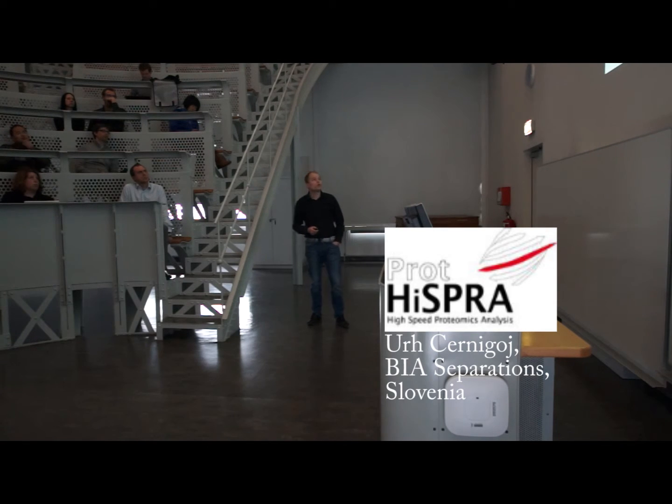Then we took peptide samples, phosphorylated and non-phosphorylated peptides. Actually, we don't have MS, so everything we did was on classical HPLCs with UV detectors. We just wanted to prove its selectivity for binding the peptides. On the left figure, we have this titanium dioxide column. On the right figure, we have its blank, just without the titanium dioxide column.